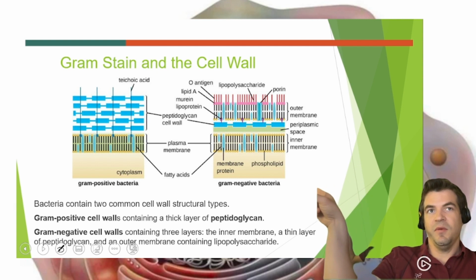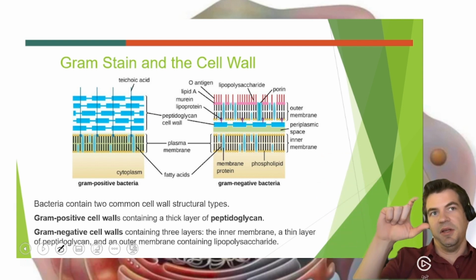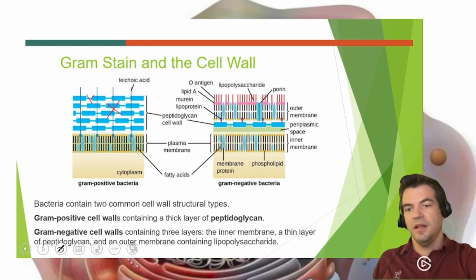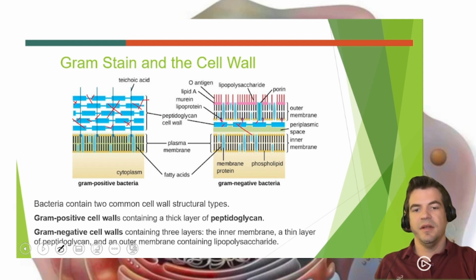Meanwhile, the gram positive over there has a lot of blue rectangles, signifying it has a lot of peptidoglycan, and that dye gets caught up in all that peptidoglycan layer, and we can't decolorize it in 10 to 15 seconds. Meanwhile, we can decolorize the gram negative pretty easily.